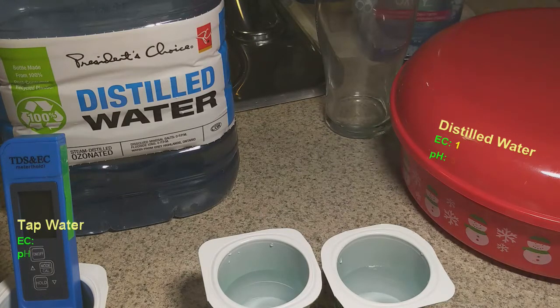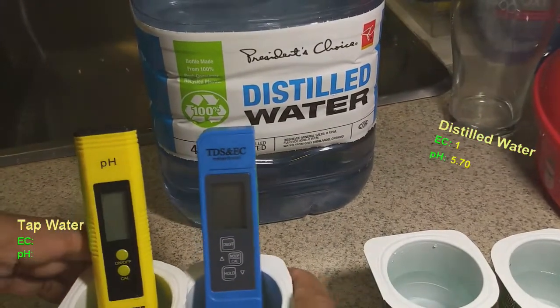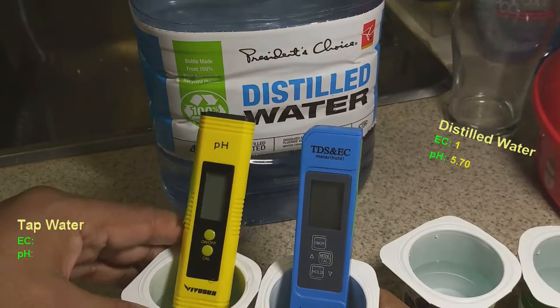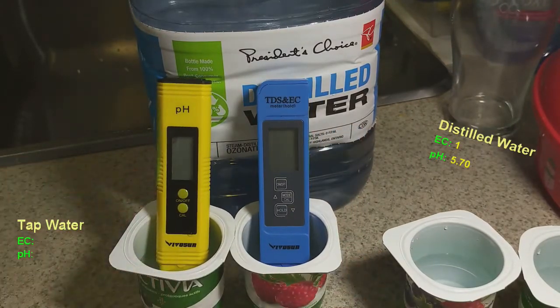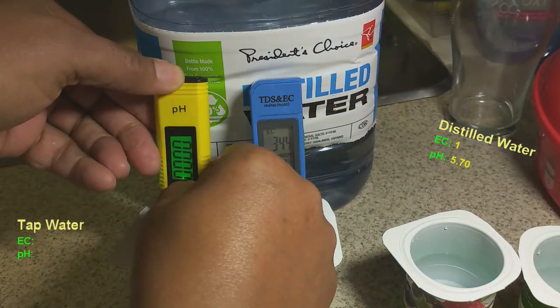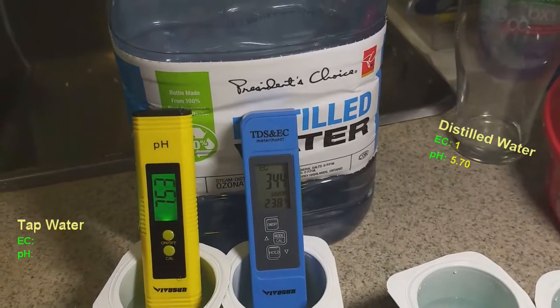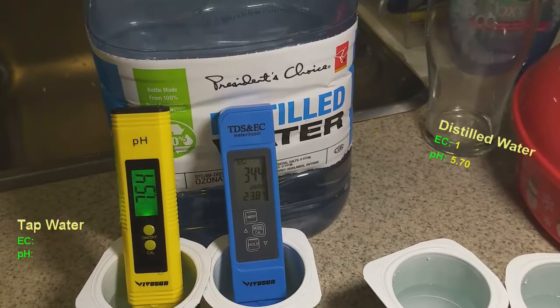This one wants to tip over, I'll fill it up a little bit more. Let me move these into range so they don't tip over. All right, let's do the same thing — switch on, switch on. The tap water is 7.56 at the moment.